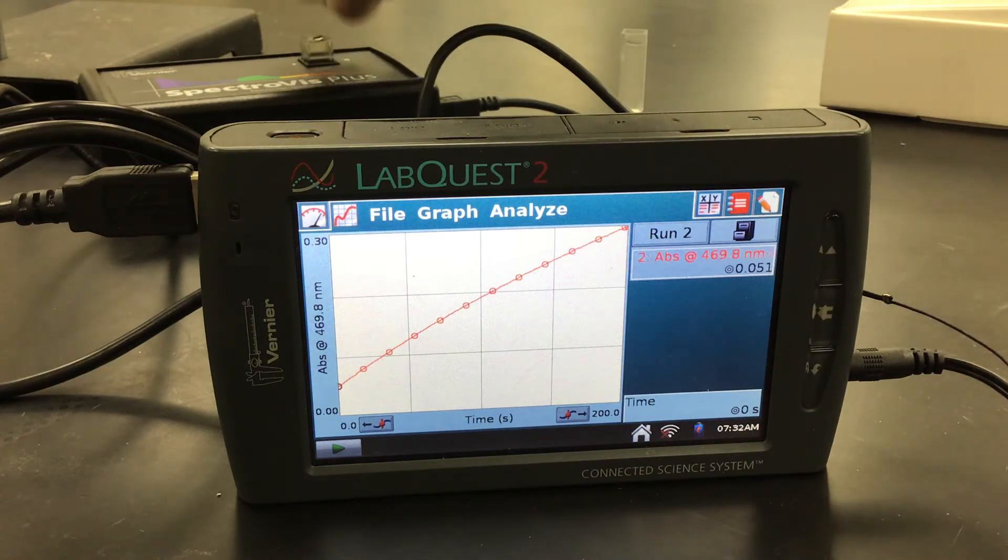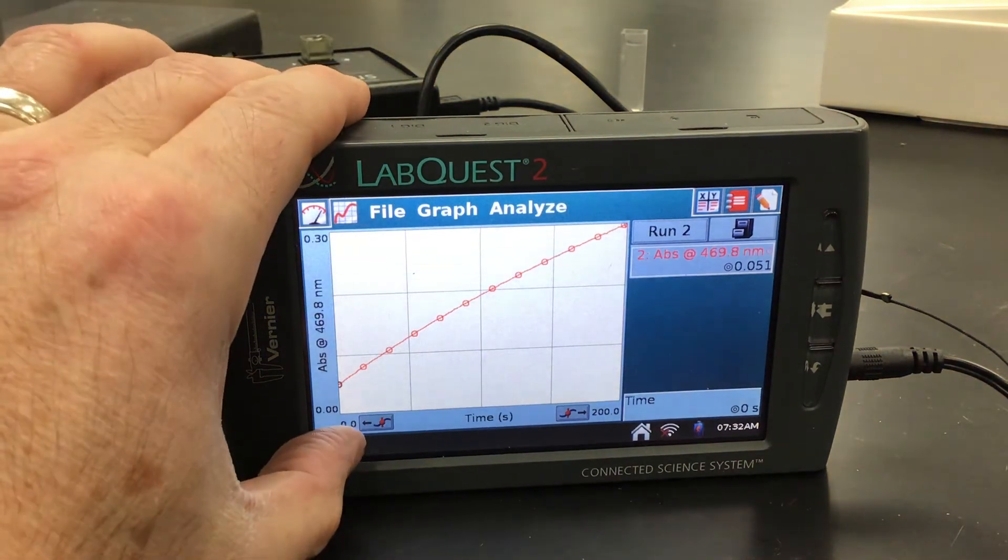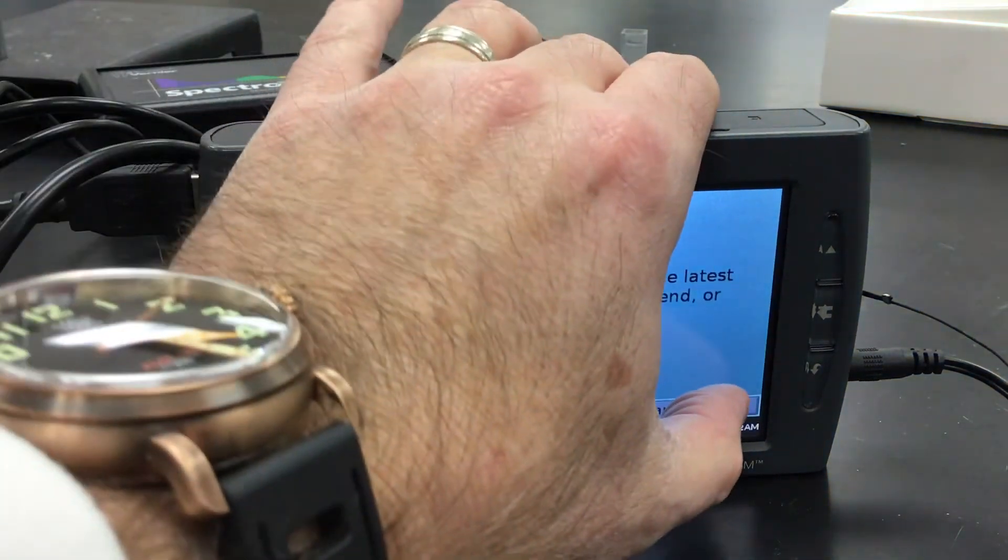Nice and clear, clean cuvette. Go ahead and collect. And again, I'm going to hit store.